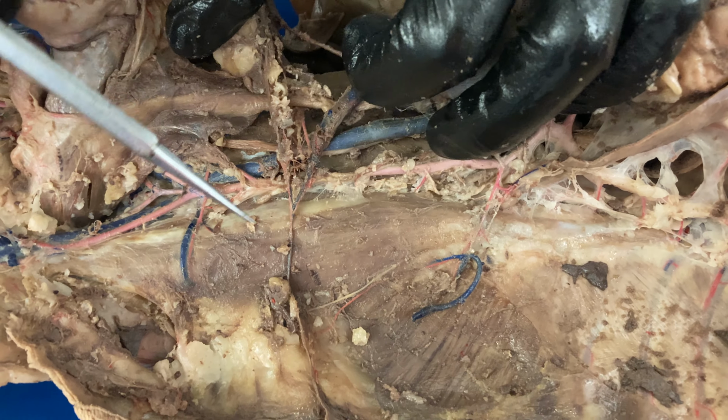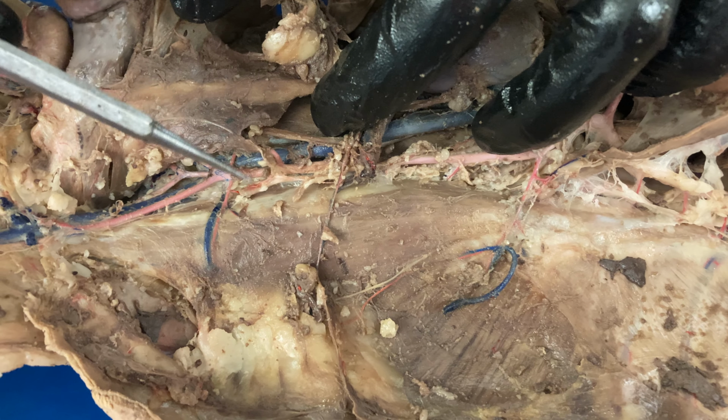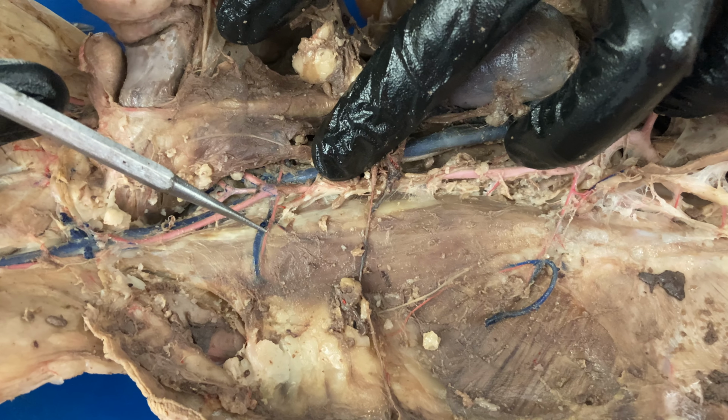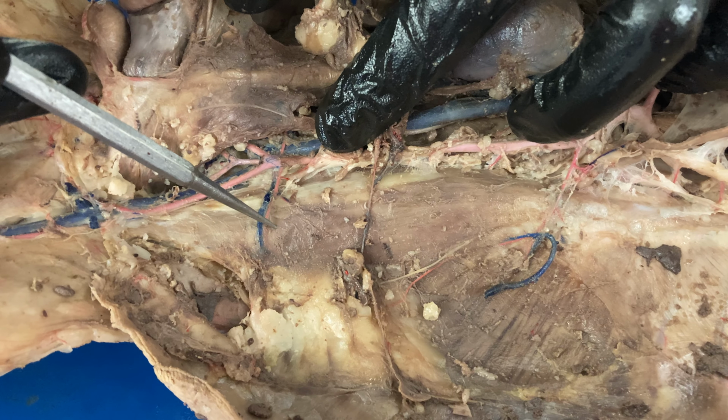Okay. As we continue down, the next branch off of the aorta that you want to look for, and there's a lot of tissue down here, guys. There's nerves running through here. There's connective tissue. But this is the next branch you want to look for. This is called the iliolumbar branch, okay? Because it's going to bring blood to the iliac bone and the lumbar region.